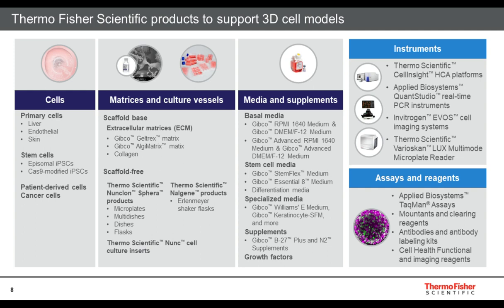I must mention also at this stage that we are not going to discuss today anything related to how 3D cell cultures are grown and how they are formed. We are only focusing on how to interrogate 3D cellular functions once these 3D cell systems have been developed. But it's good for you to be aware that we offer a very broad portfolio of products that includes cells, and also matrices and cell culture vessels.